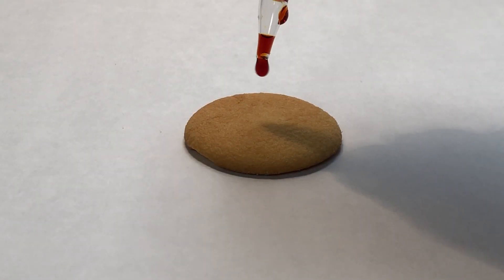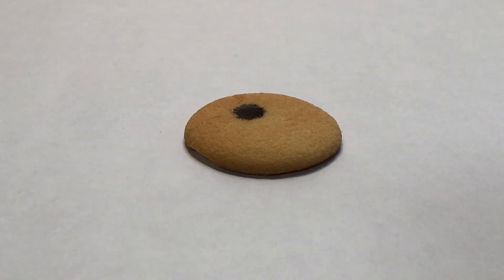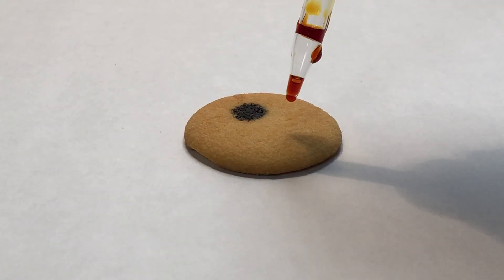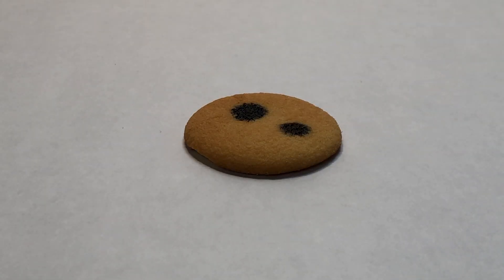Many of the foods you will be analyzing in lab contain large quantities of starch, and an iodine solution can help identify whether or not you successfully removed all the starch from your isolated sample.